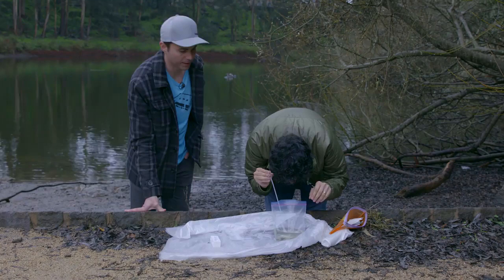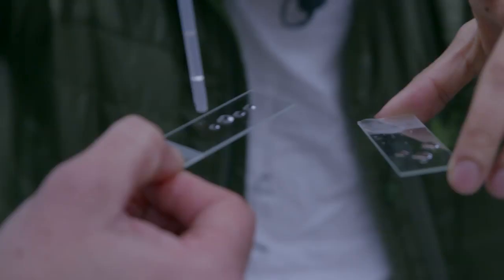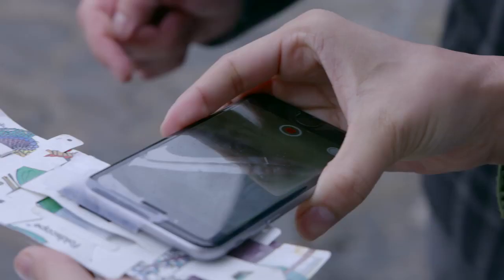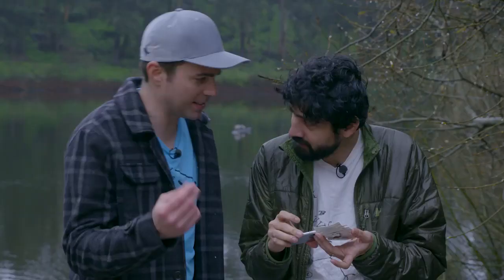But I think I'm going to get it. Got it. There it is. Oh, there he is — he's in this one. Perfect. And remember, to the naked eye you can barely see this tiny white speck. Whoa — that's the single eye. You see that? Yeah, that little spot right there. And then we look at the back — those are the egg sacs. Dude. I was not kidding. Oh my gosh! So this might be 10, 15 eggs on each side. Those are antennae. So when I was sucking it in and it ran away — it senses the pressure variation through those antennae.